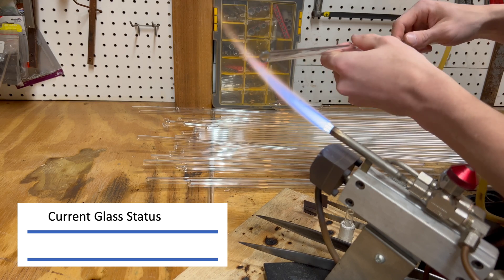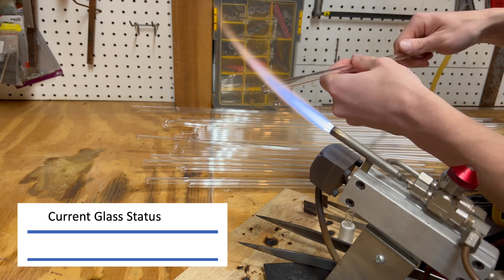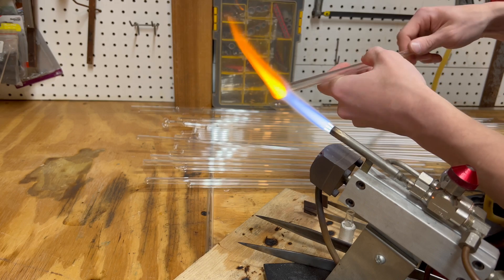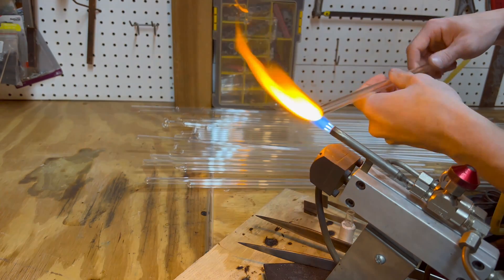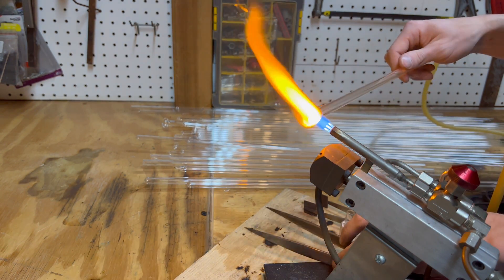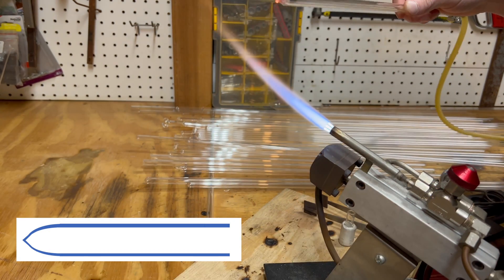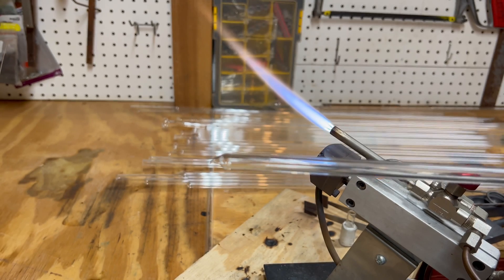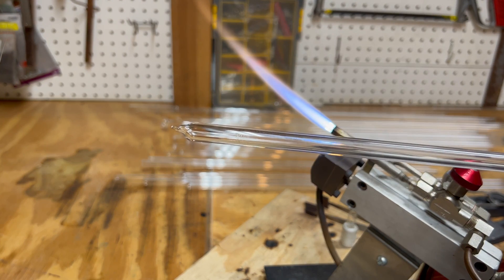Slowly bring the end of the tube into the heat while spinning. It is important to not stop spinning, as doing so will cause the glass to become uneven. Now that it has been heated up to a working temperature, the glass is pulled together to a point, using the flame to cut and remove excess glass. Melt the tip, remove it from the flame, and gently apply air into the tube. This causes a dome to appear at the end.